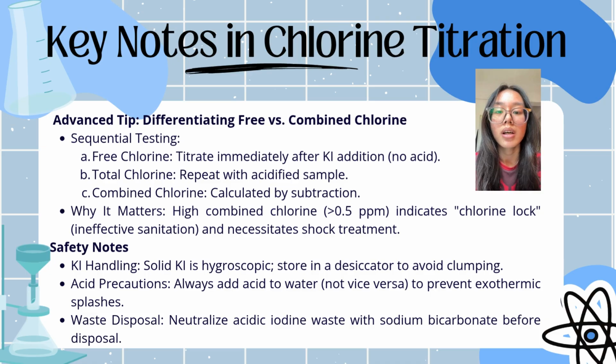Third one is waste disposal. Acidic iodine waste should be neutralized using sodium bicarbonate, which is baking soda. This ensures safe disposal and avoids environmental or chemical hazards.